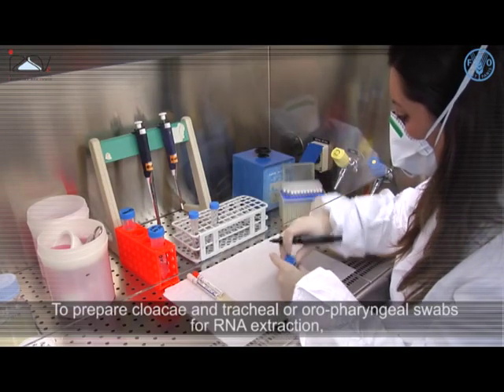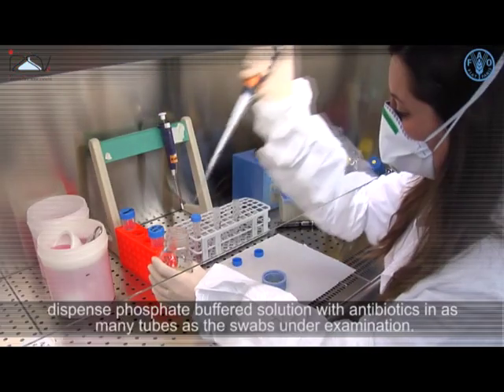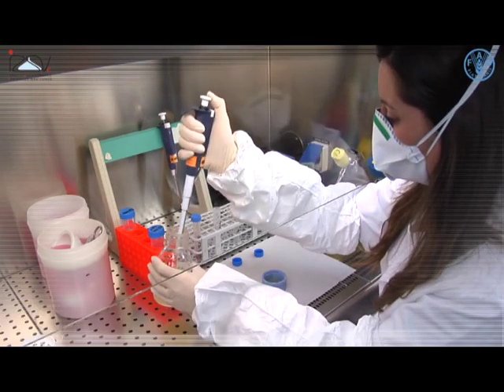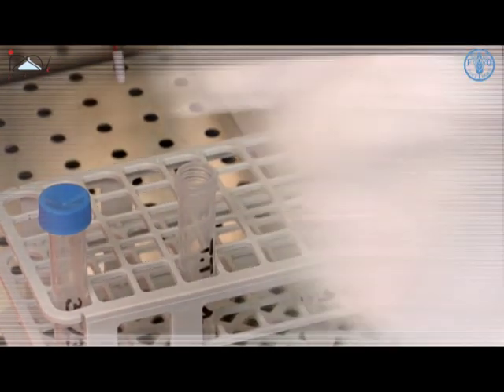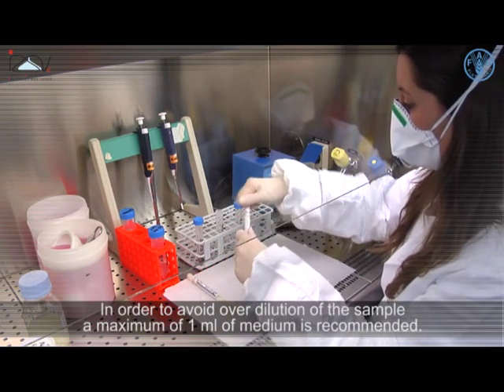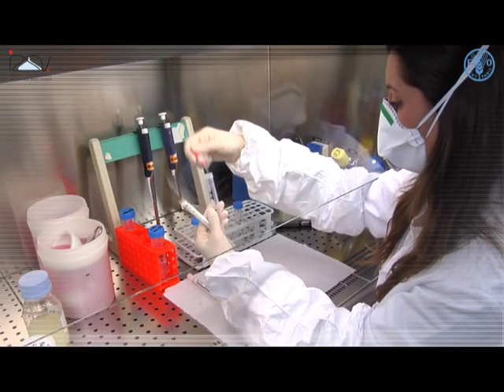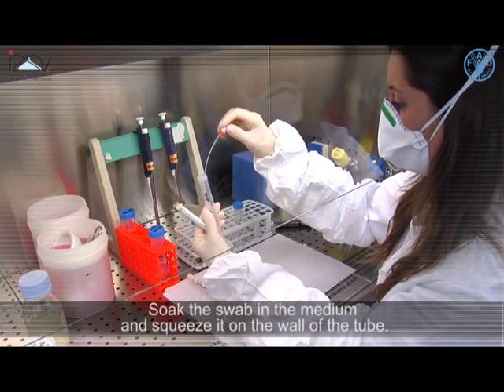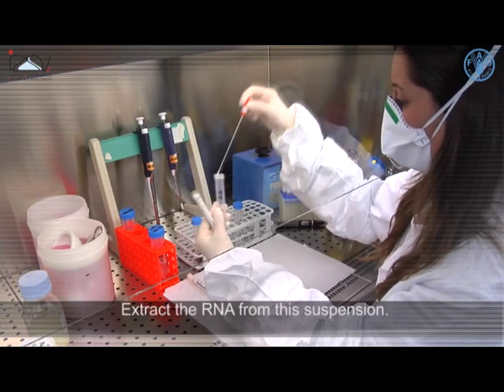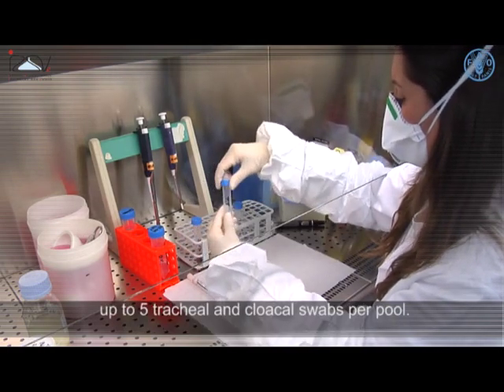To prepare cloacal and tracheal or oropharyngeal swabs for RNA extraction, dispense phosphate buffered solution with antibiotics in as many tubes as the swabs under examination. In order to avoid overdilution of the sample, a maximum of 1ml of medium is recommended. Soak the swab in the medium and squeeze it on the wall of the tube, then extract the RNA from this suspension. It is possible to pool samples from the same group of birds, using up to 5 tracheal and cloacal swabs per pool.